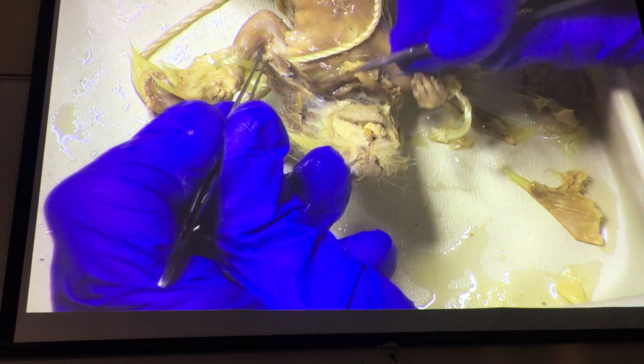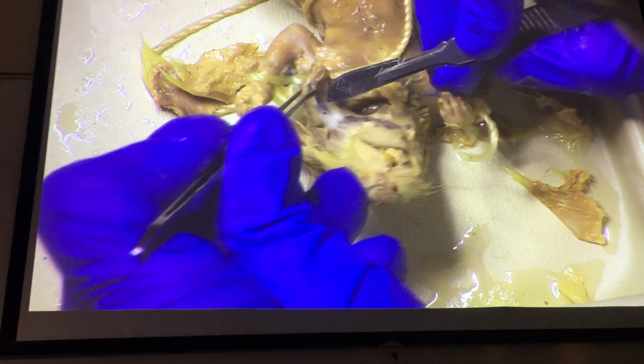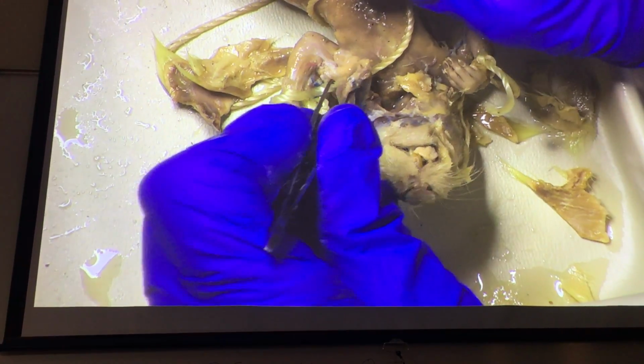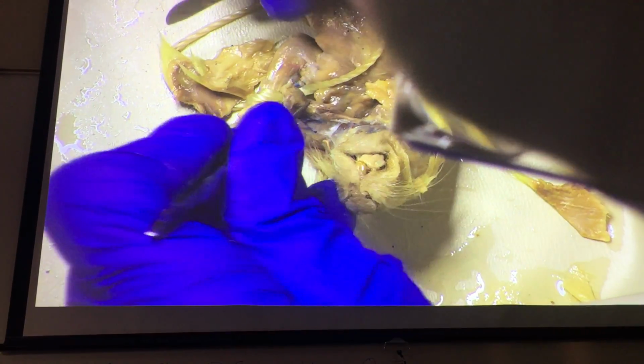They're described as having a corned beef-like appearance. Same is true for the pancreas and all that. In fact, you've probably already seen that, Ethan, right? When you're in human anatomy, I think they're on that right now.